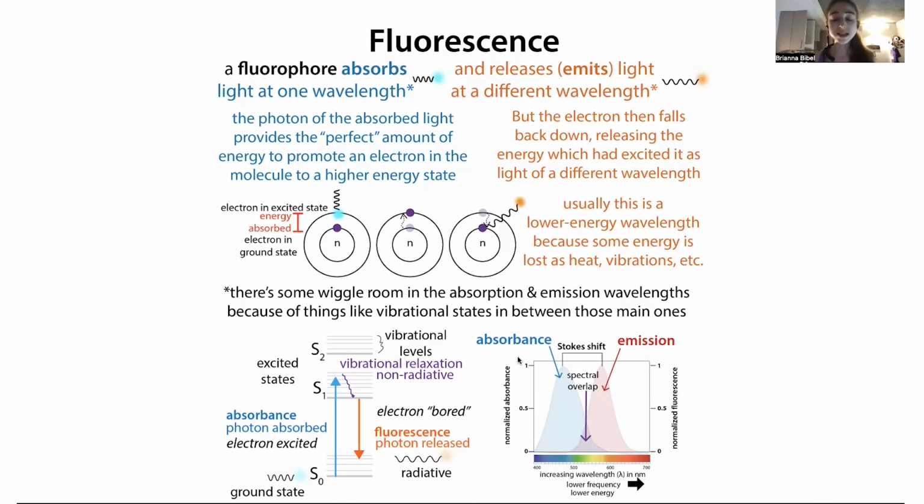And typically, there are various methods that we can use, and there are different names for luminescence when it comes from different sources.